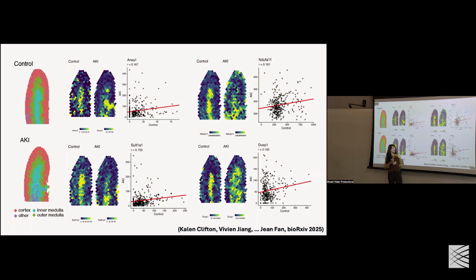So it is true that it tends to affect primarily the genes with more modest R values, at least so far that we've seen in a practical setting. But actually, most genes are in this ballpark. Maybe I cherry picked the ones that are a little too extreme, but in the distribution of R values, most genes are in the middle.